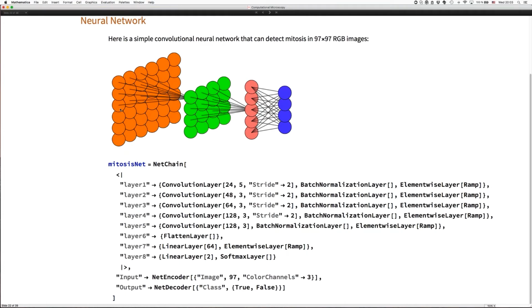Now, in order to avoid an exorbitant number of parameters to learn, what we do here is we have a convolutional net. That means that in the next layer, only the neurons in the vicinity, for example, here in the top left corner, connect to the neurons in that corner, and so forth. We would just move on. Then we would have a next group of 3 times 3 neighborhoods that then connect to the next layer, and we won't connect everything with everything. This very much resembles a kernel that moves along an image in a convolution scheme. That's why these things are called convolutional kernels.